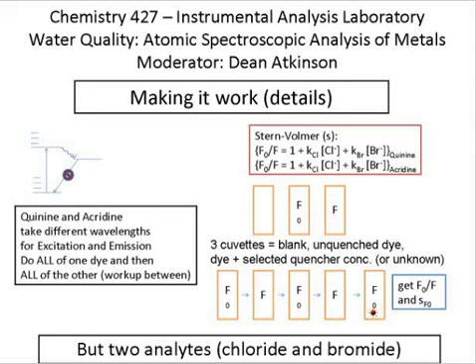So why are we doing all of this? Well, every time you measure the F naught and measure an F and come back to the F naught, those 2 F naughts should be about the same value. So it's a good way to keep track of whether the system is drifting. If the system is drifting, measure the entire set again. Once the system stabilizes to the point where the F naughts are roughly constant, just moving around a little bit due to noise, then you're going to get a good measurement of F naught and F. While the system is drifting, you will never get a good measurement of F naught and F, even if you averaged, for instance, these 2 F naughts and averaged these 2 Fs. So wait until the system is at a constant level.